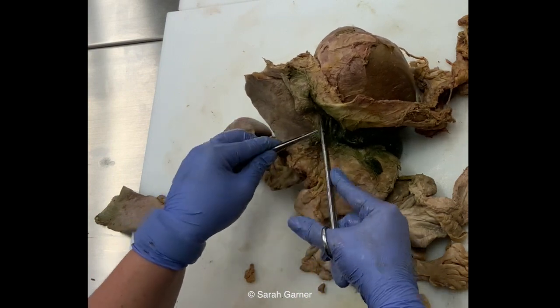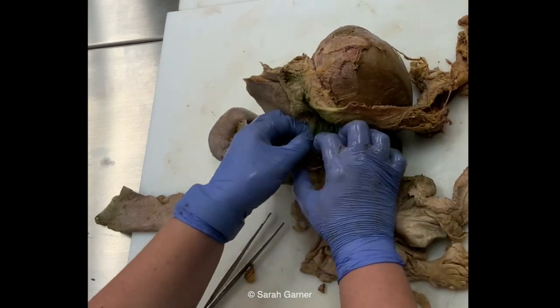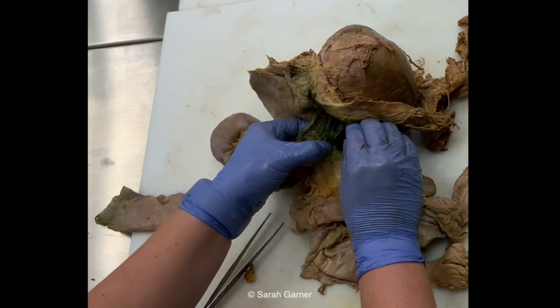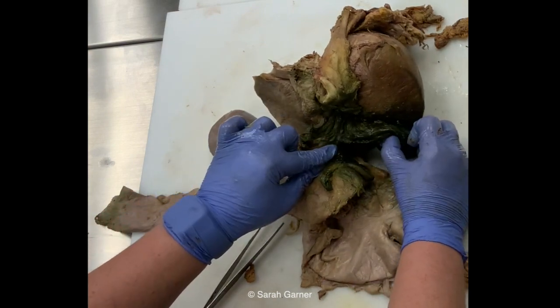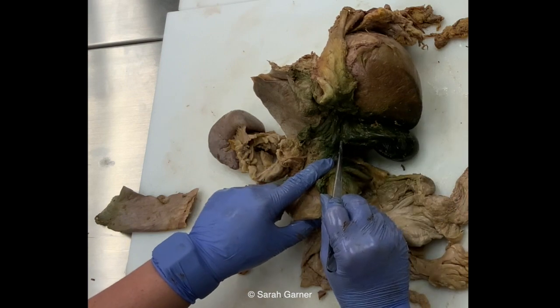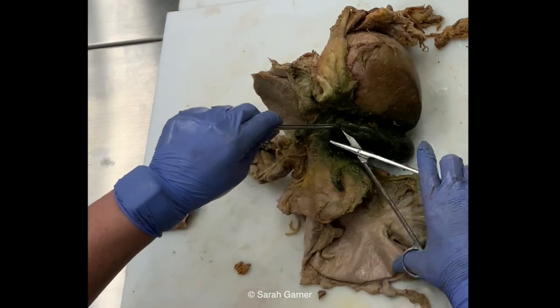And you should be able to find, if you remember the components of the porta hepatis, your hepatic portal vein, your proper hepatic artery, and your common bile duct. Remember, the common bile duct is gonna come down like here. So you have your common hepatic duct, cystic duct, common bile duct. You can separate those out and then open it how you want.